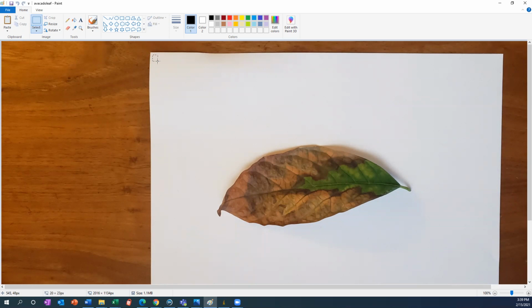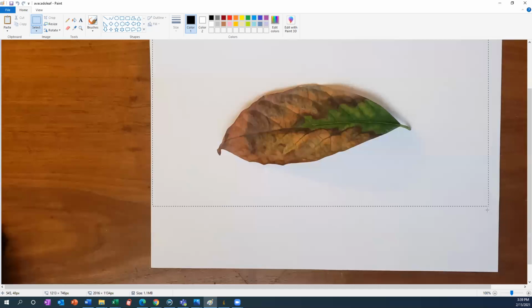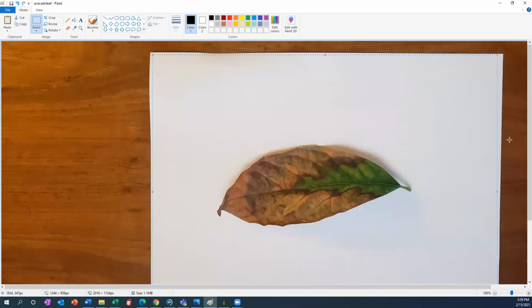If you can see where those dashed lines are going, this is the place that we're cropping the picture to. And then scroll down and make sure that you don't have any of that backdrop. In my case, my backdrop is the table. So I don't want to have any brown wood in this picture. I just want that nice 8.5 by 11 sheet of paper. We're going to pretend like the section that I've cropped is indeed the whole 8.5 by 11 sheet of paper. Now, if we're doing this for real, we'd use fancy scanners that'll take care of this for us. But we're doing this with our cell phones, right? We're doing applied crop physiology. We were doing this all in real time.